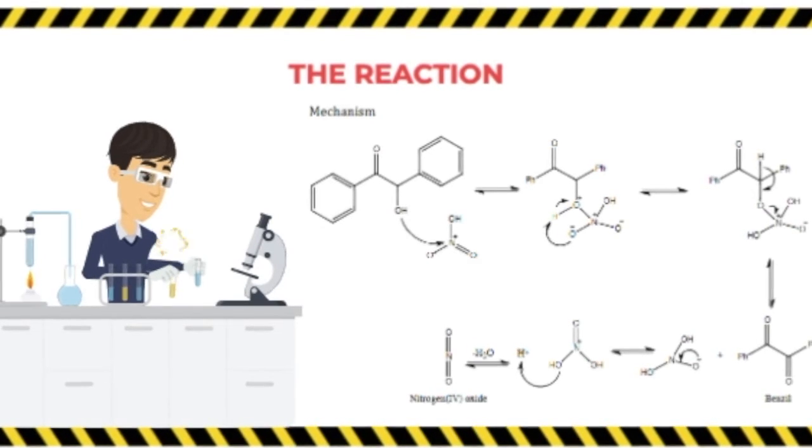Okay, at this stage in the video, we have already discussed the composition of the desired product, that diketone compound known as Benzil, as well as the composition of our starting material, benzoin. We've also discussed that confirmation NMR step, which can be used to confirm that we have our diketone product Benzil and not benzoin or a compound with other impurities. If we had benzoin, you would see a couple more peaks indicating a few additional hydrogens in the overall molecule, which is not good since we were trying to achieve a different product, Benzil. Benzil, having the absence of that alcohol group that benzoin has, is going to have fewer hydrogens than benzoin.